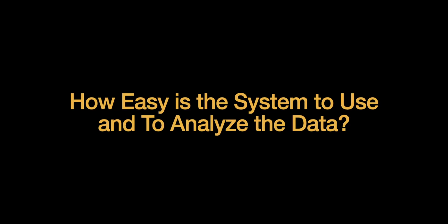As one concrete example of that, we did some studies where we had an ovariectomized mouse model. And of course, with surgical models, you sometimes have metal wound clips that are visible in the field of view. And that can be really problematic in terms of tracking things like body composition and bone mineral density. So we had a great relationship with the application scientist. We were able to come up with a solution for excluding any pieces of metal in the field of view so that we could get accurate data.